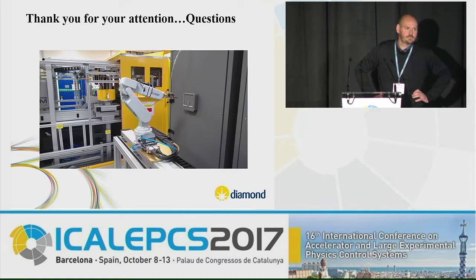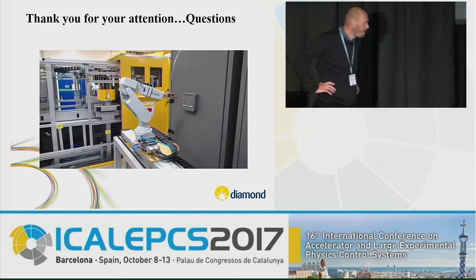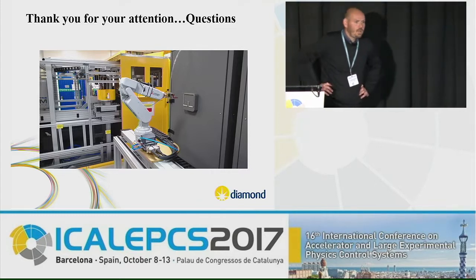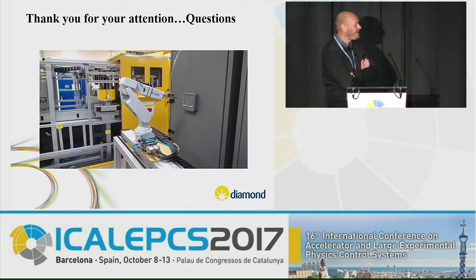Is there any other question? I had a small one. Do you plan to also do this automation for pins or only for plates? So the sample mounting and... Oh, so for pins. Okay, yeah. That's quite a live topic at Diamond. We're still using the old GDA, and they have an in-memory queue for that as well. So this is a complete departure from how it's done at the moment. It's only for plates. No, it's completely adaptable, right? You just follow the same model, and it's relatively simple. But you're dealing with legacy code, so it's whether this will work.